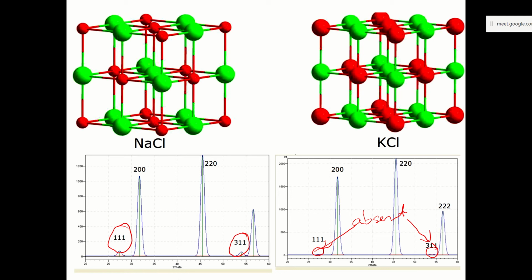That NaCl picture that I have shared with you, the crystal lattice with the different coordinates, and then you substitute there f plus is equal to f minus, so certain lines will go missing. Wherever there is a f plus f minus term appearing, there will be reduced intensity.